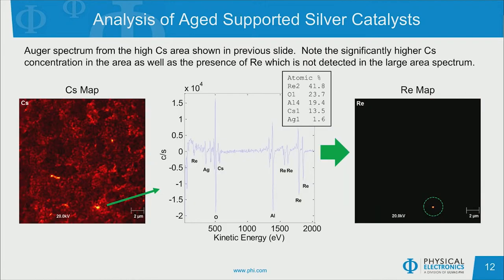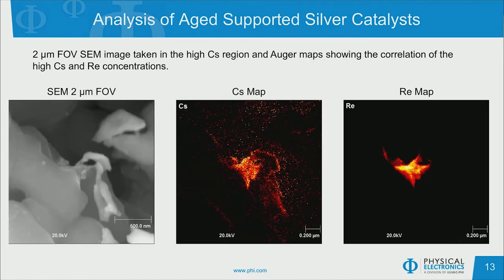We can continue the analysis of the bottom cesium hotspot by performing a localized survey spectrum of that particular particle region. We see an increased cesium concentration of approximately 13%, and also see indication of rhenium in this location. With this information in mind, we can perform a rhenium map across the entire field of view, and we do see that rhenium is also located in the hotspot of cesium. To get very fine detail of the rhenium hotspot region, we collected a 2 micron field of view SEM and performed both a cesium map and a rhenium map. We are able to see a cesium feature approximately 200 nanometers across, and the rhenium map shows that rhenium is also co-located in the area with high concentration of cesium.